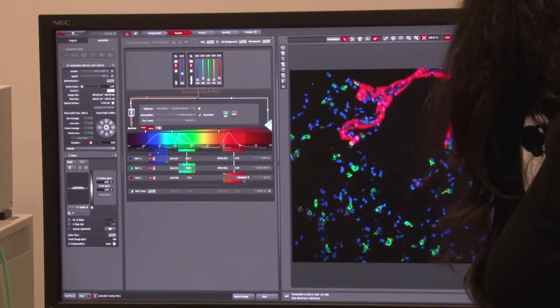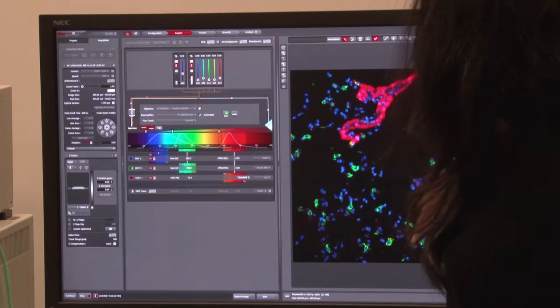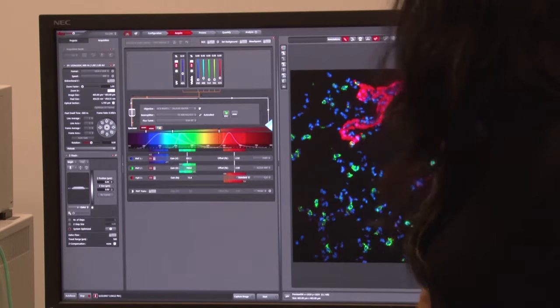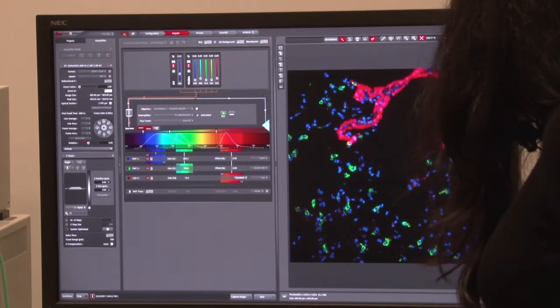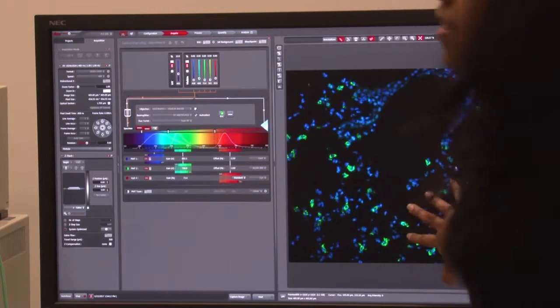And what you see in red is a transcript that marks club cells in the airways. They are also known to have sparse puncta, or low levels of expression, in the alveolus, but most of the expression is enriched in the airways. And Tushar mentioned this in the morning. So this is the airway and this is the alveolar epithelium.